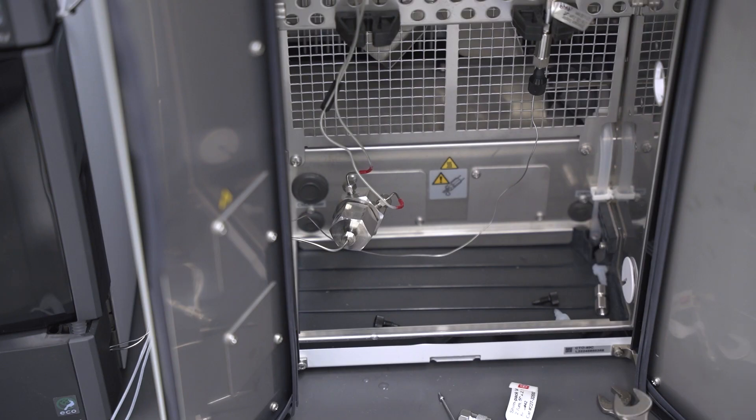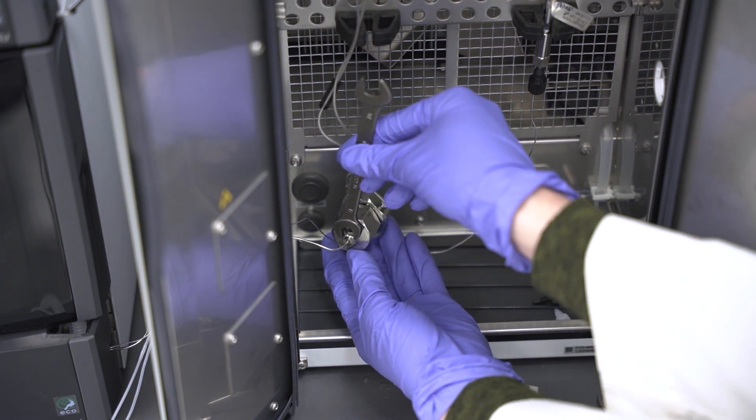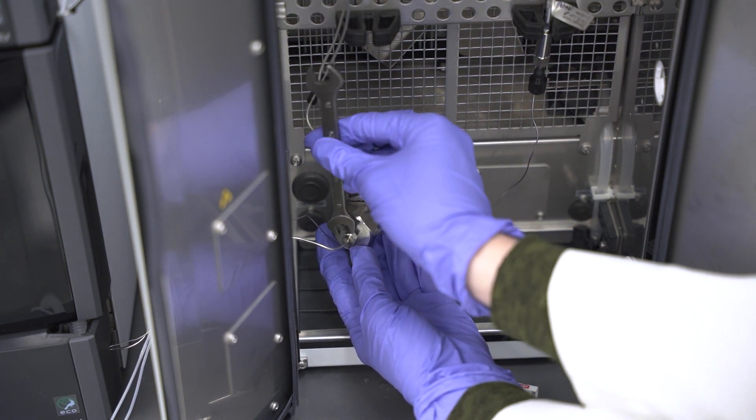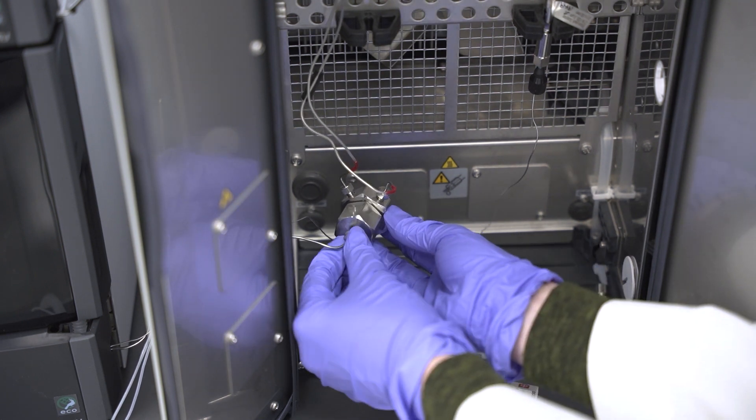Start by disconnecting the out flowing tube from the mixer or mixer out. Make sure to keep this tubing connected to the high pressure valve of the auto sampler.